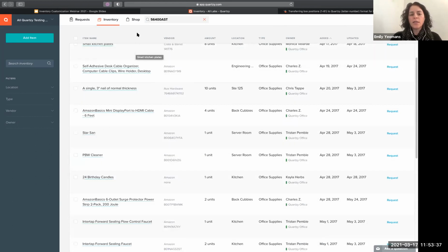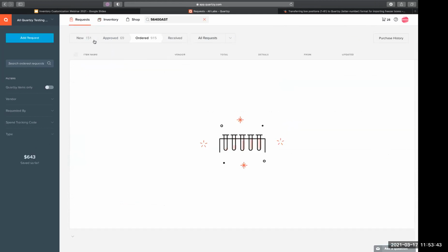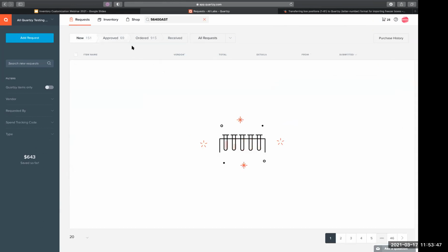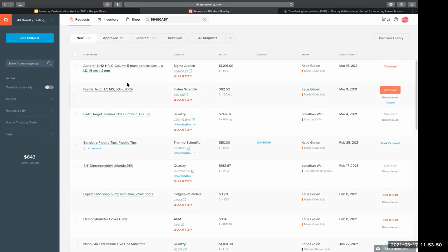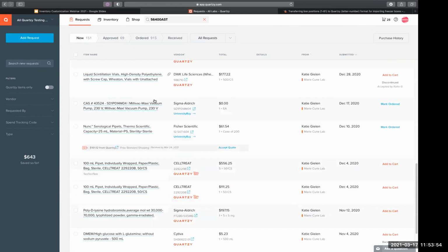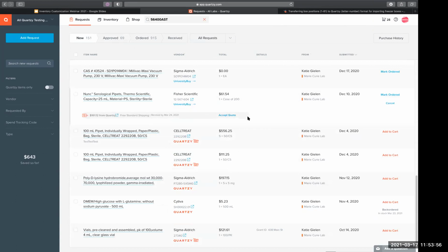There was a question earlier about equivalent matches. Where do those happen? Katie, correct me if I'm wrong. I believe those happen in requests. Correct. So let's go to the request module and see if we have any sitting there for us. Let's see. So here's an example of one.